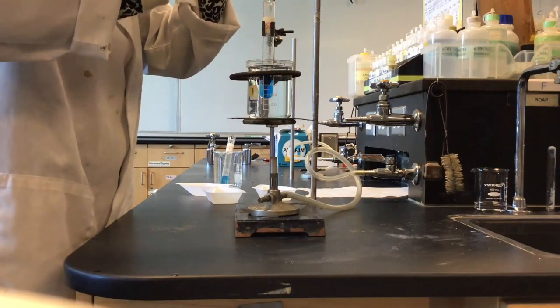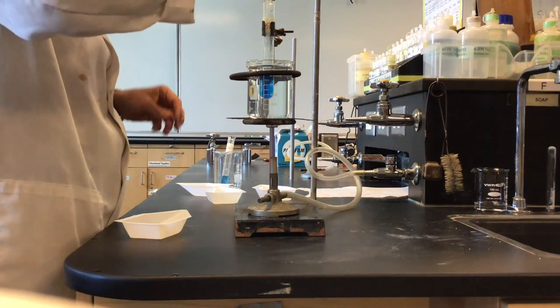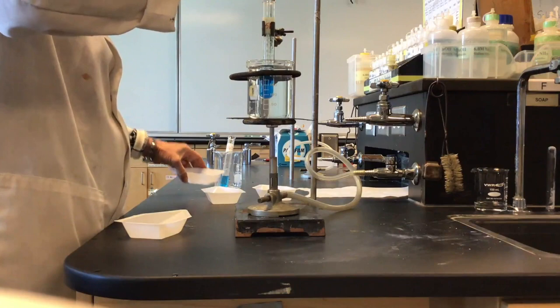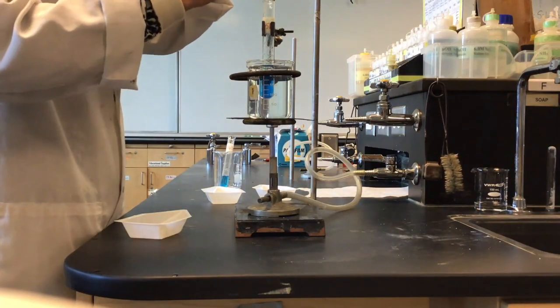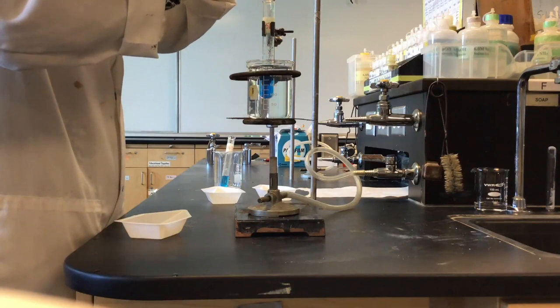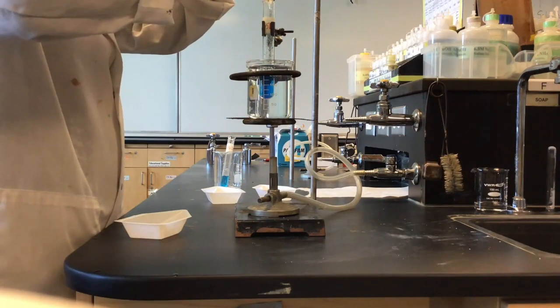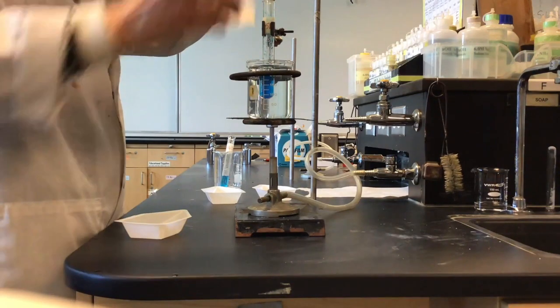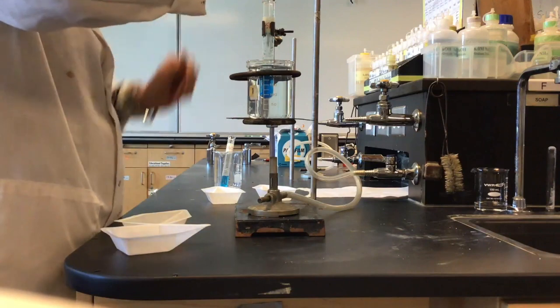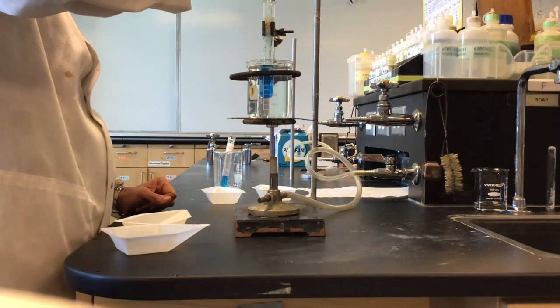Adding increment number 8. Still dissolving. You have to have patience as a chemist. 9. Might be getting close.